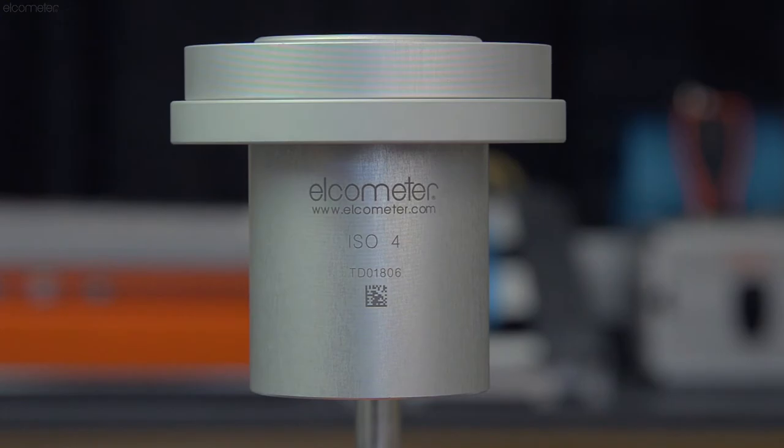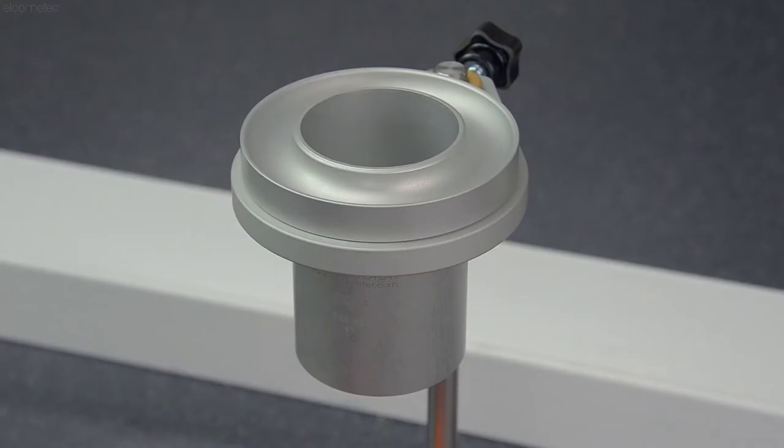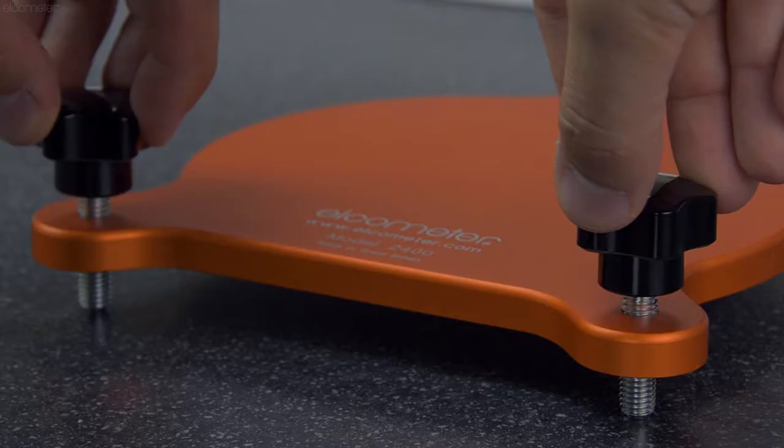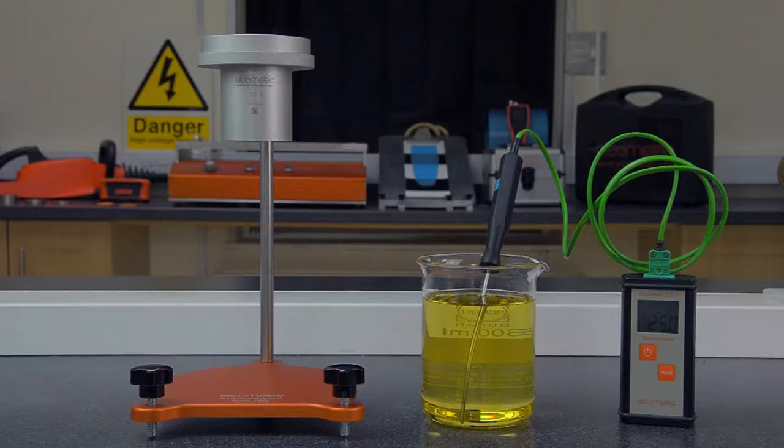Insert the flow cup into the stand, then ensure the cup is level. To do this, place the glass plate and bubble level on top of the cup, and adjust the feet of the flow cup stand until the bubble is centred.